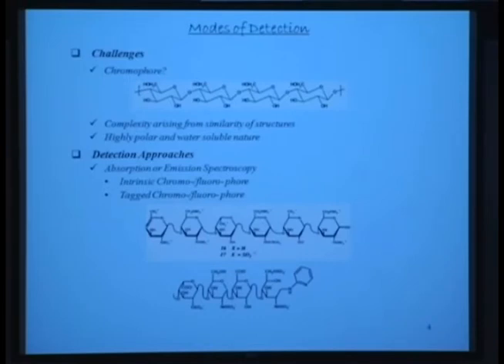Refractive index is independent of molecules, but very few people really use it. But in the extreme case, you can't label it. There is no chromophore. There is no background chromophore. Okay? And you're left with nothing. You might want to try RI.